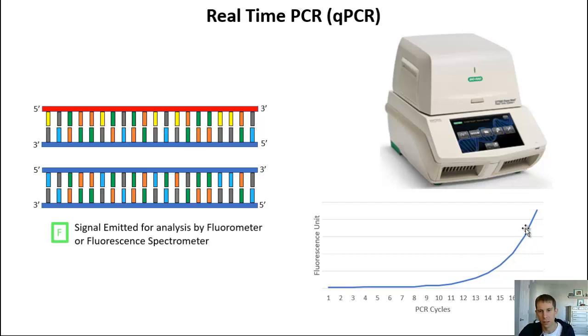If the fluorescent unit continues to grow with the number of PCR cycles, so essentially if we see a spike here, then likely there was the RNA of COVID-19 in the sample. If it does not, if it flatlines across or there's only slight growth because over time probably some of the TaqMan probe could theoretically be disrupted, then that means that there is not a positive test for COVID-19.